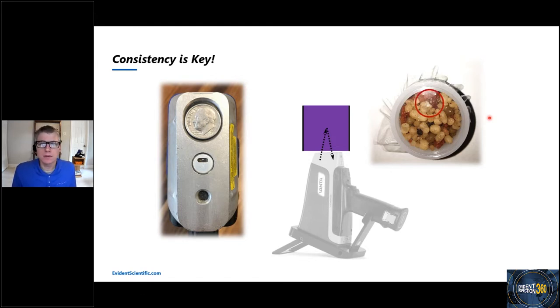green. Okay, well, with an 8 to 10 millimeter spot size, depending on where I place it on the sample, in this case, you don't even have to be a geologist to know where the iron is. That's going to be in those red clumps, nice iron oxide there, right? So if I place the sample spot on this part of the sample, I'm going to get a lot of iron reporting. But if I move over just a few millimeters, you can see now I have no red spots within the beam area, analysis area, and I'm going to report significantly less iron. Okay, here when I took a test, I got about 0.35% iron reported.